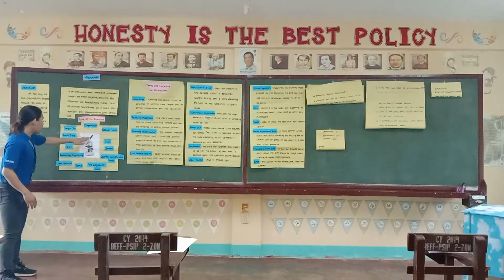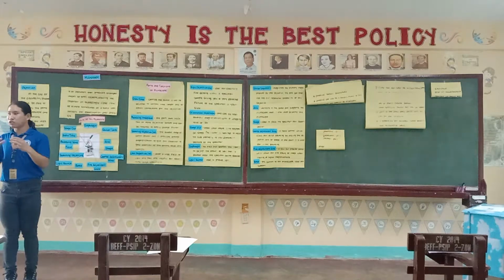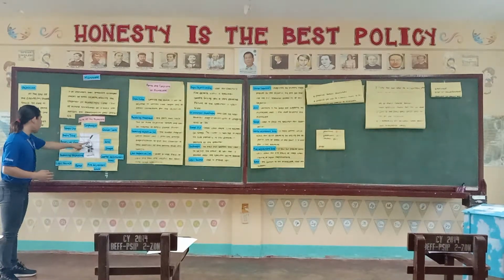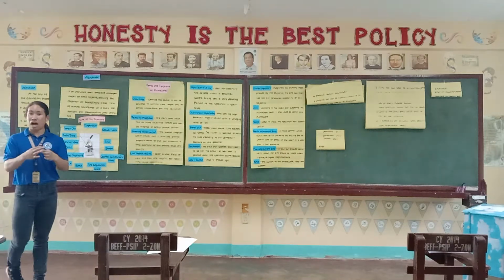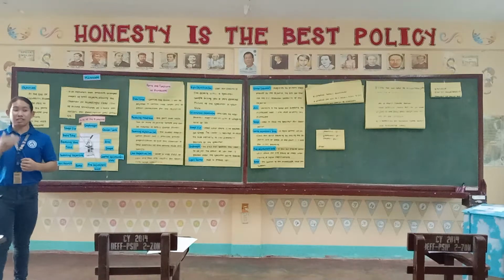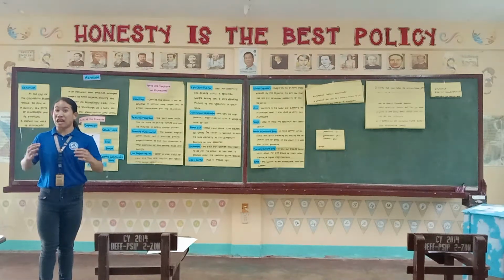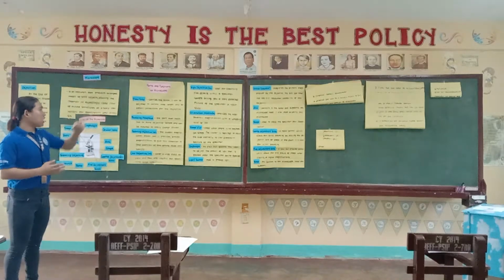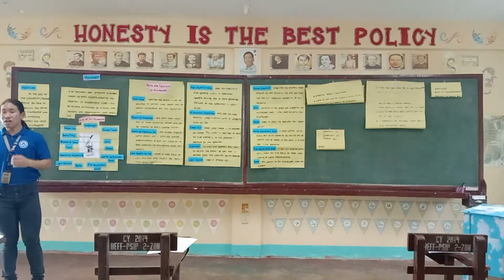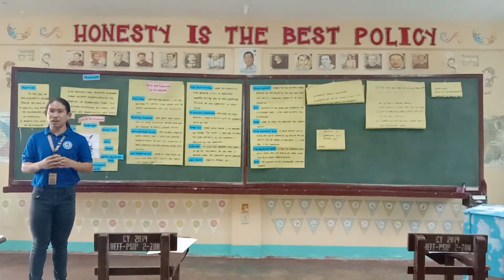So meaning to say, as an observer, dili mo makita ang structure primarily. So after that, you can adjust directly using the revolving nose piece para ma-adjust mo ang isa ka structure depende sa imong part as an observer. For example, if you are an observer, to adjust the primary source of the ocular eyepiece, you have to use the revolving nose piece, be able for you to clearly see how fine the structure is.